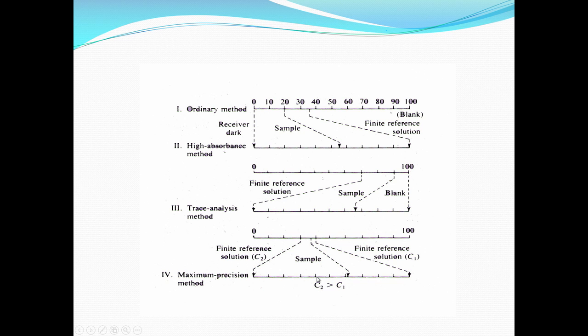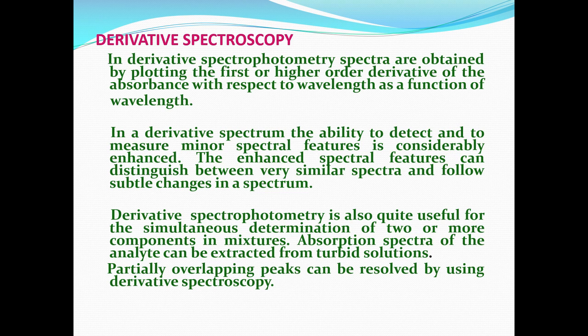So, there are 3 systems, even though I have put 4. You can choose either this or this or this, depending upon the maximum precision required for the analysis. Now we go to another utility of a spectrophotometer.